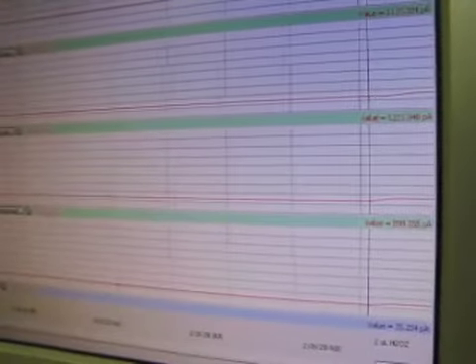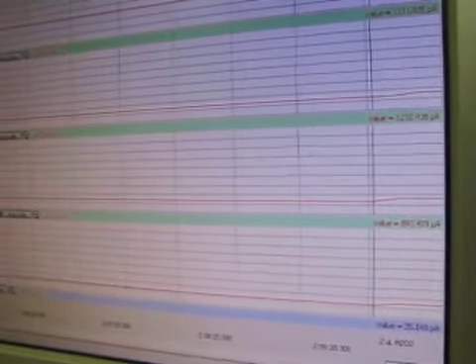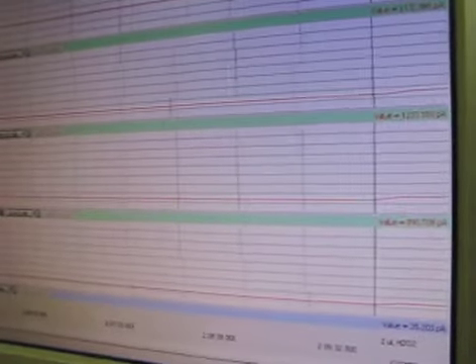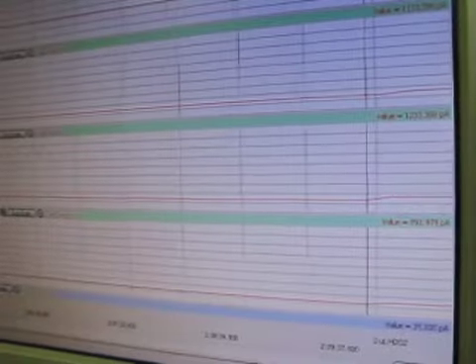You can see the black line that indicates the mark where we put the injection, and you see the gradual increase in response of current. I'm going to get the next injection ready. Doubling this will be 4 microliters, which will result in a final concentration of about 200 nanomolar.